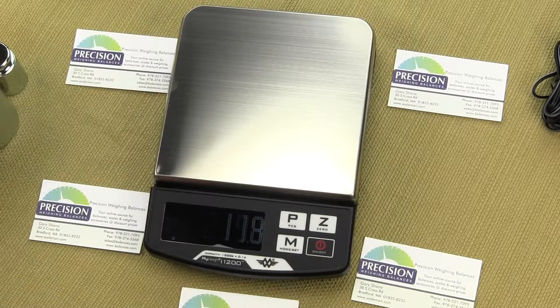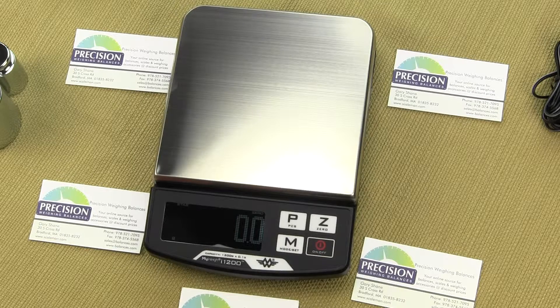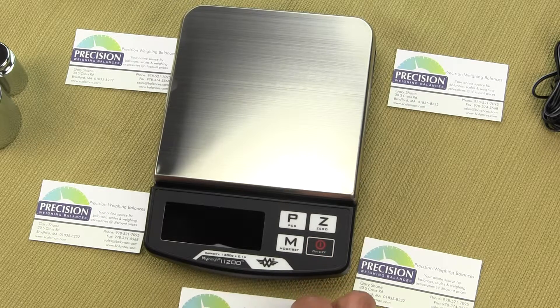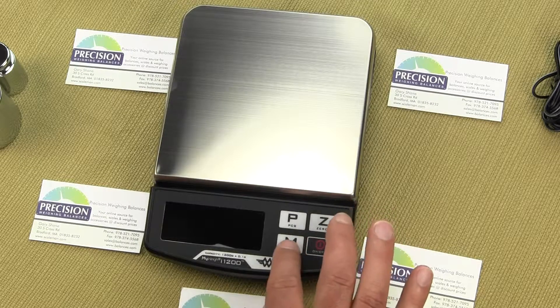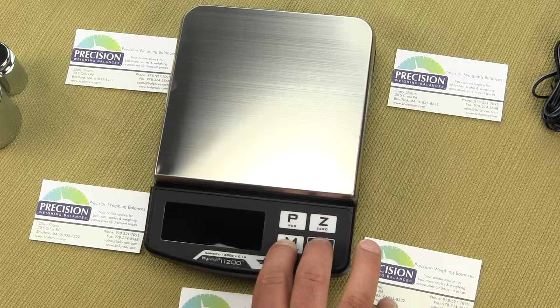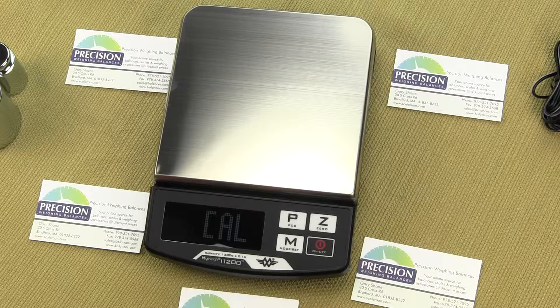Now we'll go through how to actually calibrate the scale, which is pretty simple. First, shut off your scale entirely. Then press the M key first, and then press the ON key and release. You'll see the display says CAL and then shows a random number. This number is from the ADC converter — for example, 22,070.